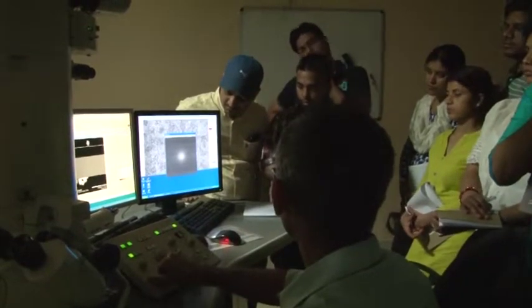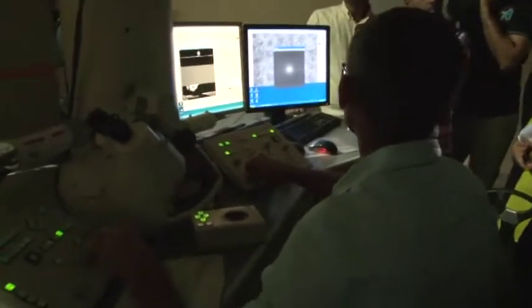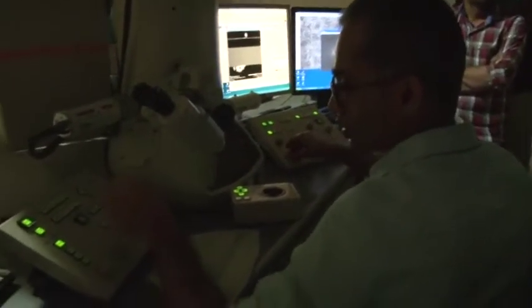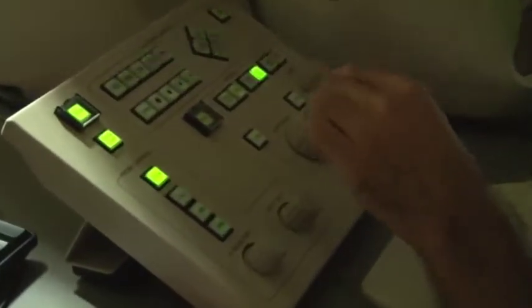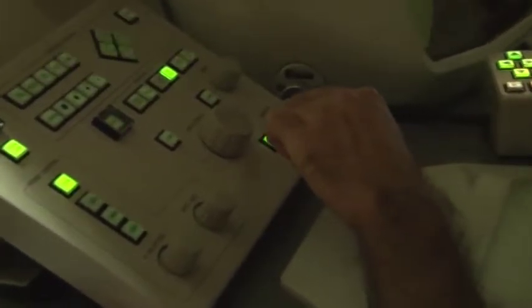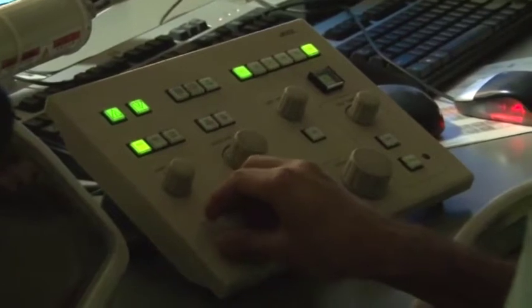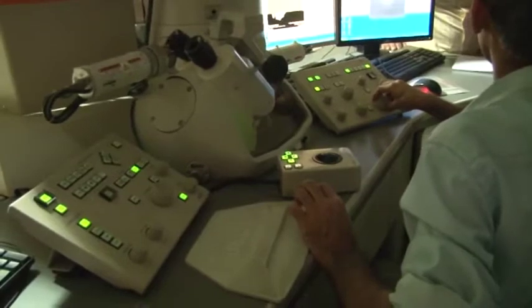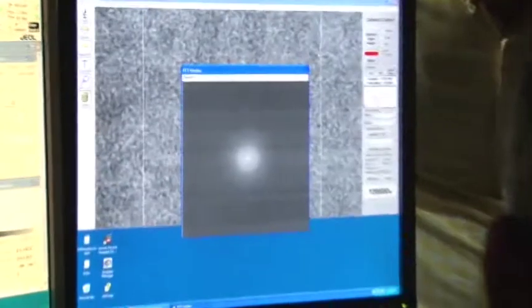And there are different values for how to generate contrast. Some are very well defined because you know this defocus value, you can calculate that for the experiment voltage. If you are just in between, then you get a high resolution pattern, but it's not best defined. So the best resolution is only given for one defocus value. Like a polycrystalline gold film is there, so I just take it in focus and take it as effective of that.